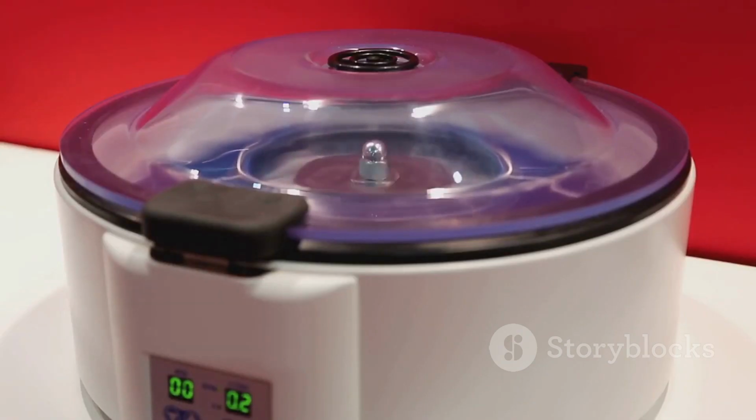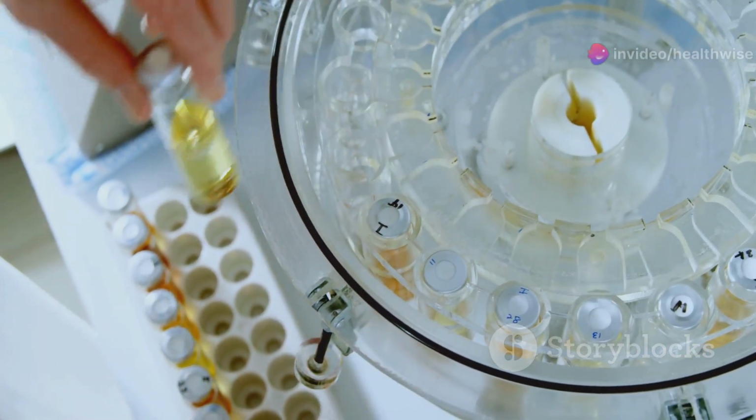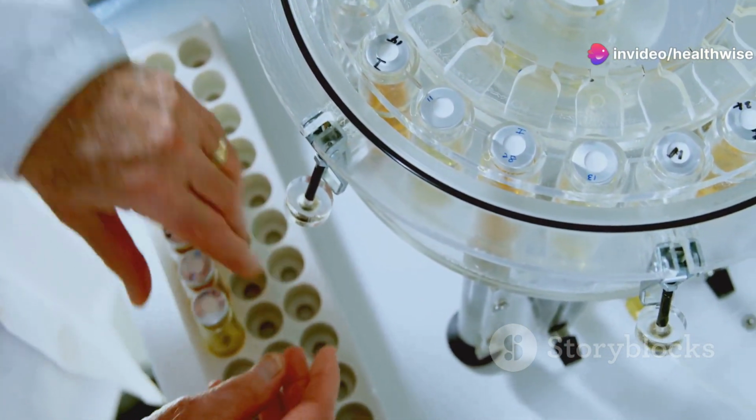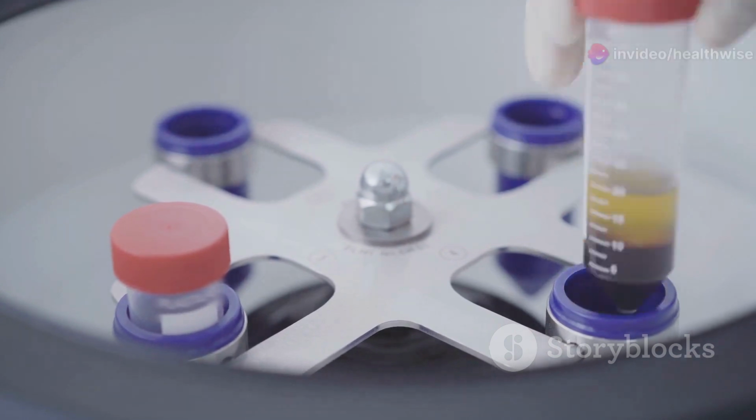Section 4. A centrifuge for every spin. Different types and their uses. Just like there are different tools for different jobs, there are various types of centrifuges designed for specific applications. Let's take a look at some of the most common types.